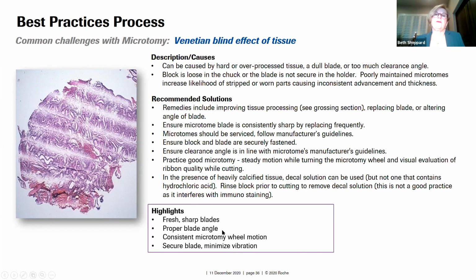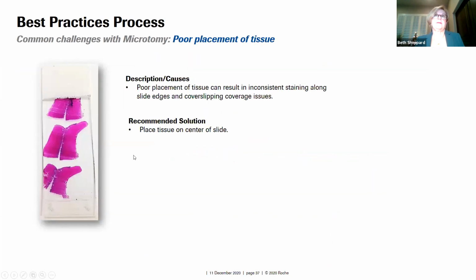So make sure you have fresh, sharp blades, and that your blade is secure. I think those are the key takeaways.